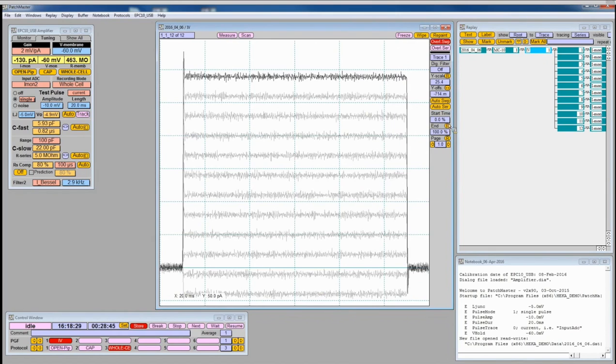While we are at it, we can explain a little bit about the oscilloscope window. For example, this button here says DIG filter, which means it's the digital filter that can be applied to the data. It will not change your raw data trace. It will only be applied to your displayed data, okay? Not to the raw data trace.